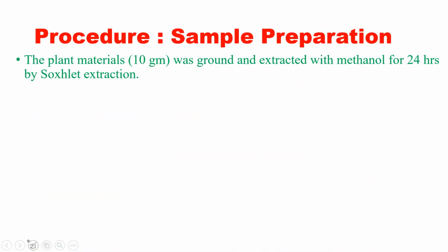Now further, like sample preparation, here we can take any gram. I have taken 10 gram, but it is not mandatory that you take 10 gram. Whatever the reference, I will show those references, some are having 10 gram, some are saying 100 grams, some are saying 5 grams. So as per convenience, whatever Soxhlet extraction assembly you have at your institute, you can take accordingly, because at the end I will tell you how to calculate for 100 gram. Usually we are calculating for 100 gram.